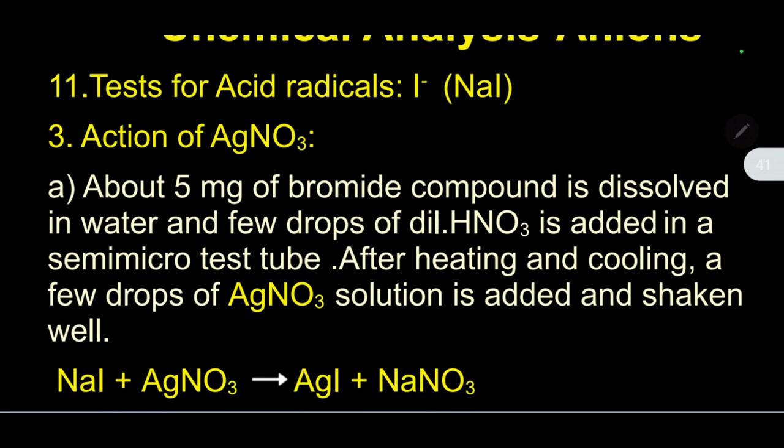Dear students, next I am going to test the iodide radical with the help of silver nitrate. So I will call this one the action of silver nitrate.